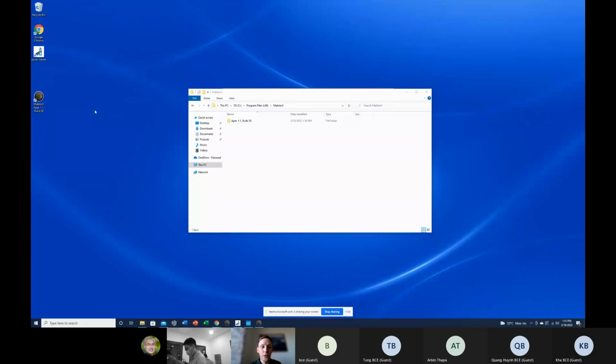Yes. So what are we going to do next? You're connecting all the cables now, right? Yeah. Super. And I will wait a little bit. Is there anything we need to unlock first?